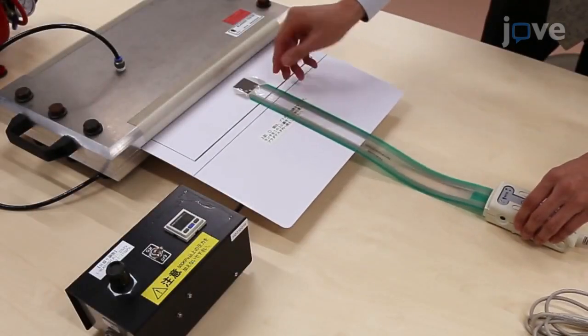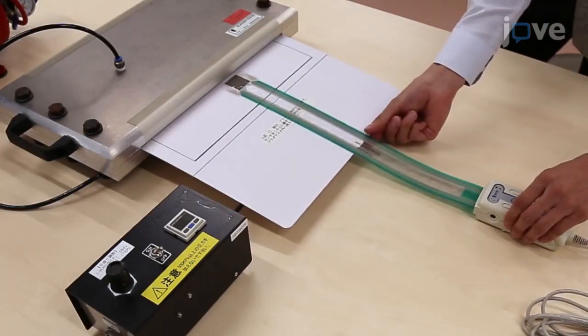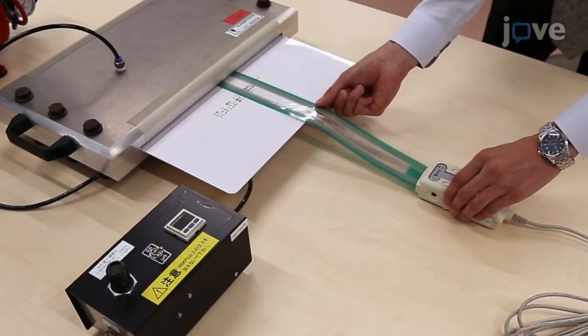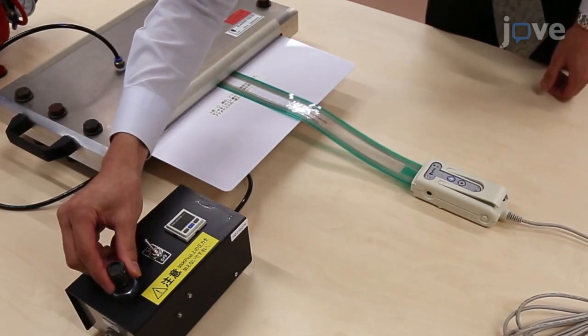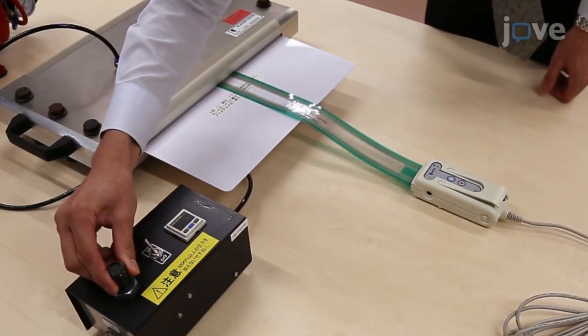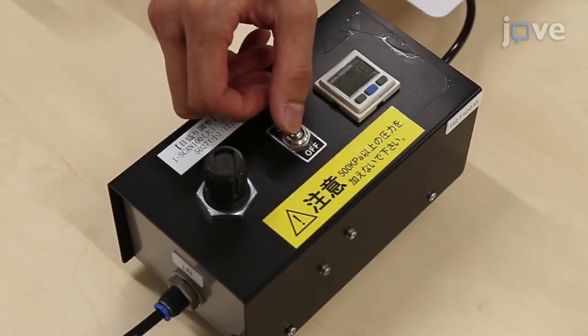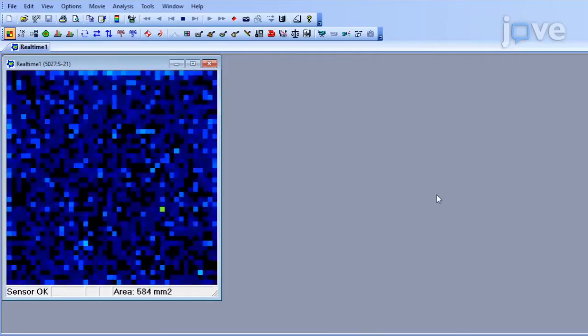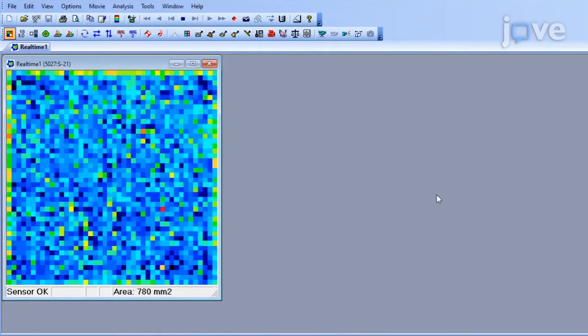To adjust the pressure, insert the sensing areas of the sensor sheet one by one into a compressor rig, and turn on the air valve of the compressor controller. Begin applying the pressure and adjust the regulator to the appropriate load value.